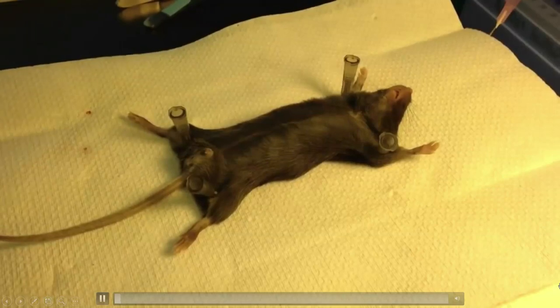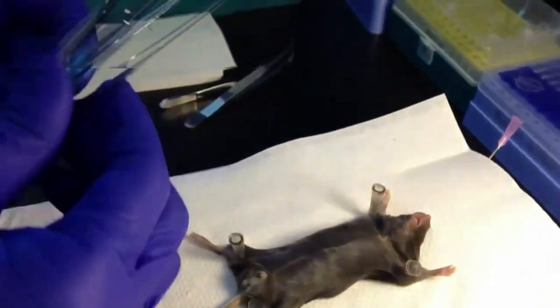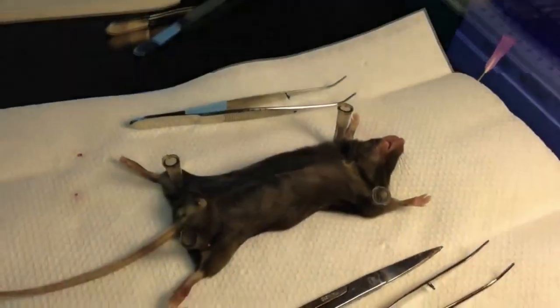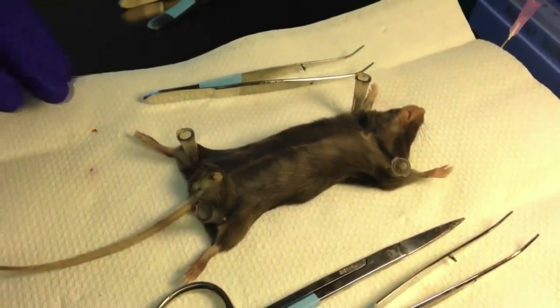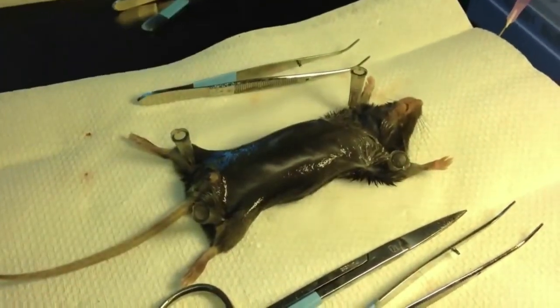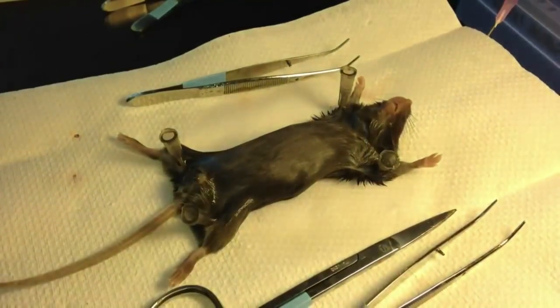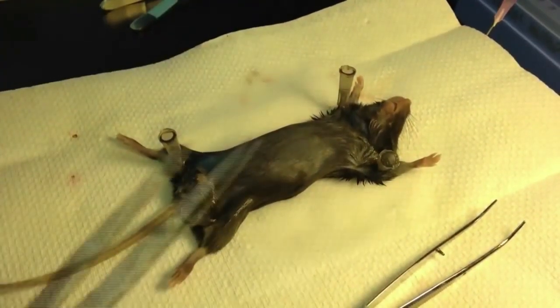Okay, so for today's extraction, you're going to need 2 sets of forceps and a small pair of scissors. Sorry, is that too close? Okay. So, first pin the mouse to the board, spray it down with 70% ethanol and give it a nice little wipe. This is so that the fur doesn't stick to your scissors as much.